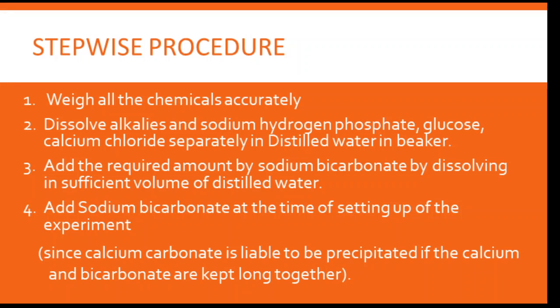If you mix it before, it forms a precipitate and the tissue will not be able to absorb these chemicals and the tissue may die.